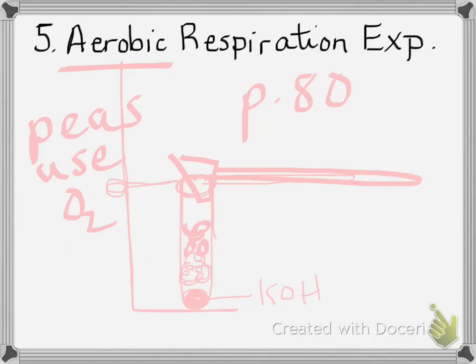Okay, now I know Janet can testify. Janet, isn't there aluminum foil around those? I left a window of aluminum foil open on each tube so you could look in each tube to see what was inside. But you remember the day we actually did it, we didn't leave a window open. We completely covered each tube with aluminum foil, yes? Why? To prevent photosynthesis. We were trying to keep the peas from doing photosynthesis. So I would ask you, why did we wrap the tubes with foil? To prevent photosynthesis.